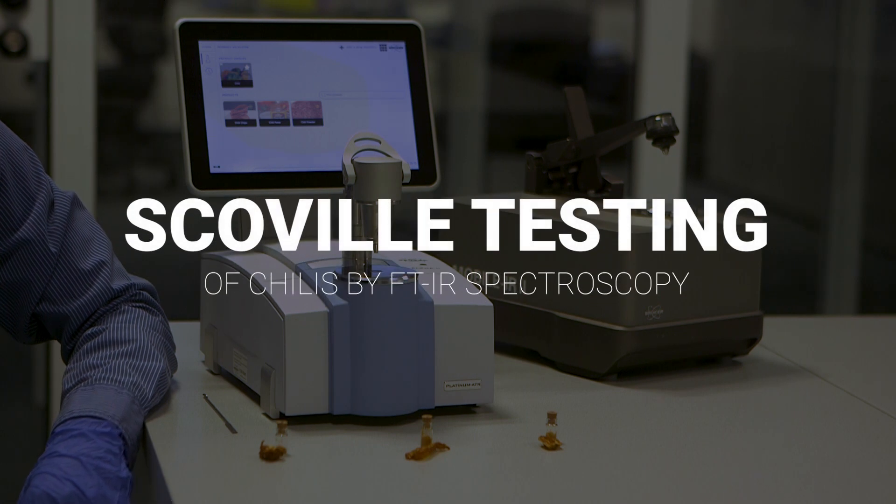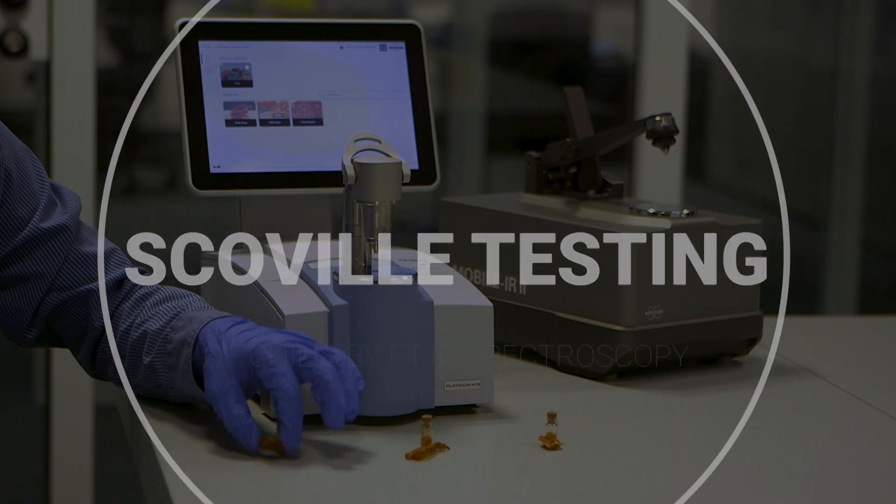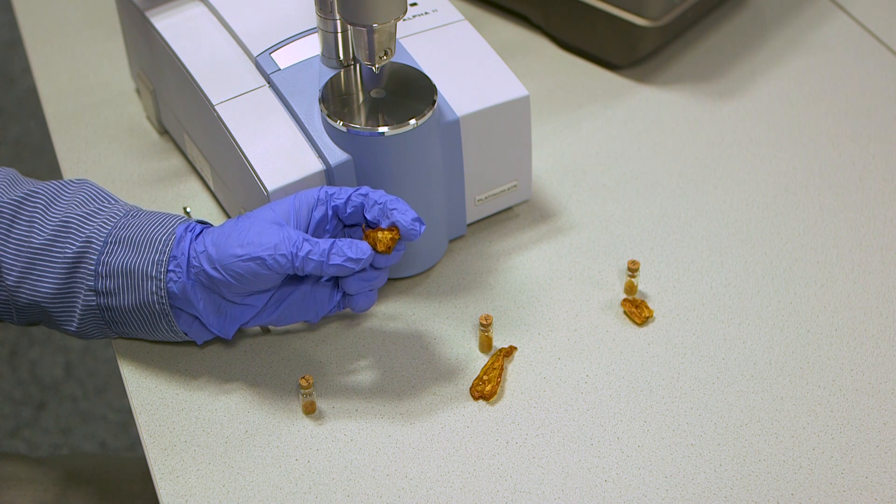Measuring Scoville Levels in Chilis by FTIR. For many of us, spicy food is a very exciting journey.